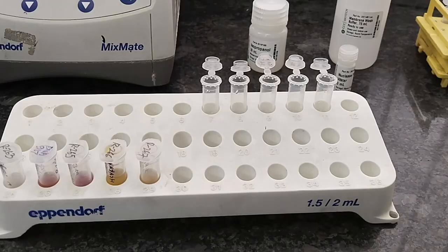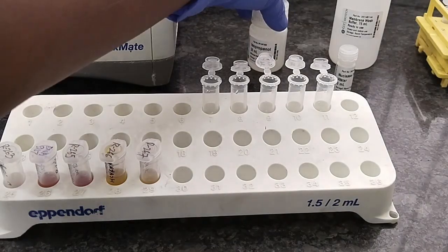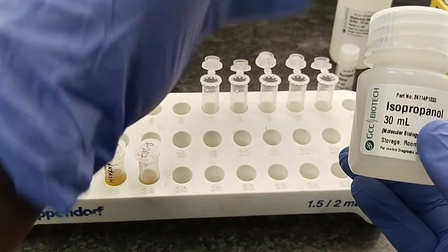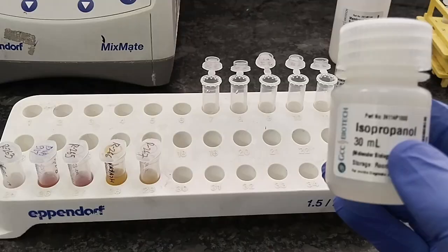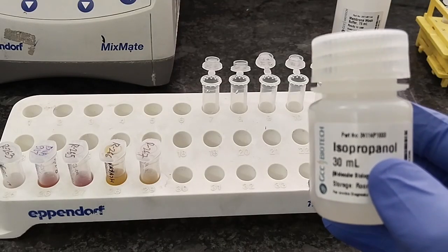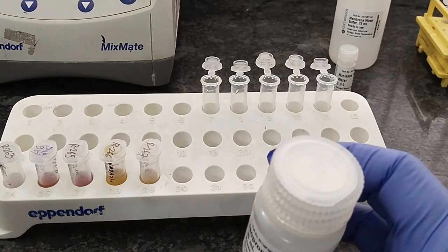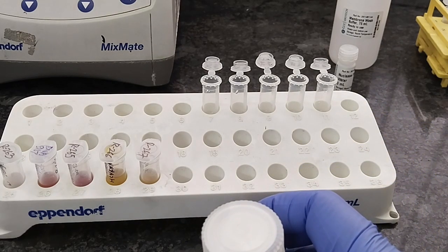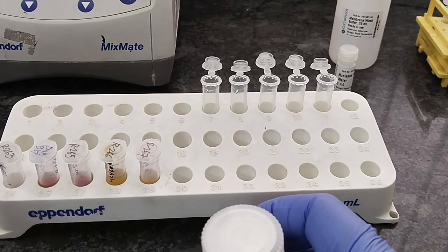Now we have to add alcohol, that is isopropanol, 200 microliter. What is the function of the alcohol? Alcohol helps precipitate the RNA. RNA is soluble in water, as RNA is a polar molecule and water is also a polar molecule. So RNA is miscible with water, and water can solubilize the RNA.